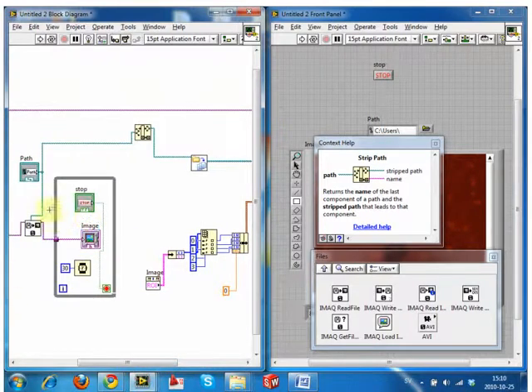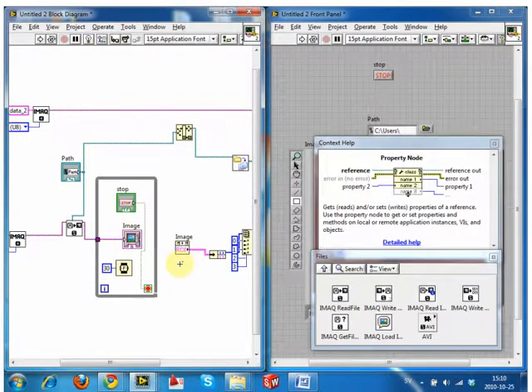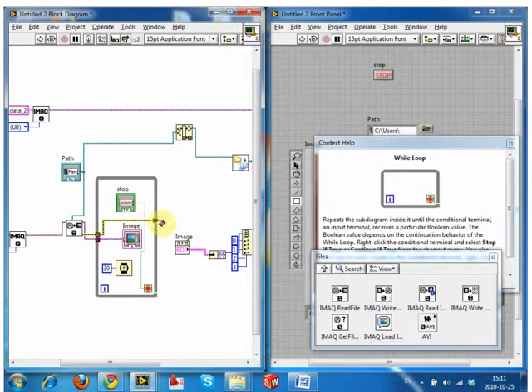We don't want it to start analyzing this data until we've chosen our box. The way we can do that is, again, with the error wire. We can use the flat sequence, the little film strip, but the easy way to do it is just to thread the error. So you click on something that has to happen first, click on the error, drag that, and then click it on the side of the loop, and then click the side of the loop into the ROI.